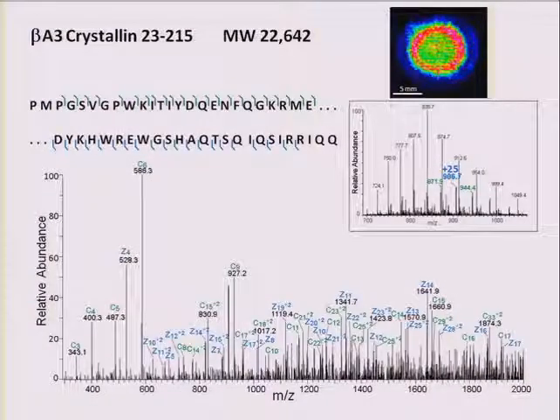And so the first point I want to make from this slide is we get beautiful electrospray mass spectra from this very, very small volume of extraction. So here is an electrospray mass spectrum of a signal at 22.6 kilodaltons from a bovine lens. This signal was imaged. So here's the tissue section that was imaged. That's the 22.6 kilodalton signal present.